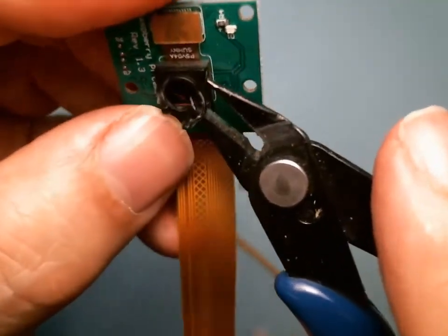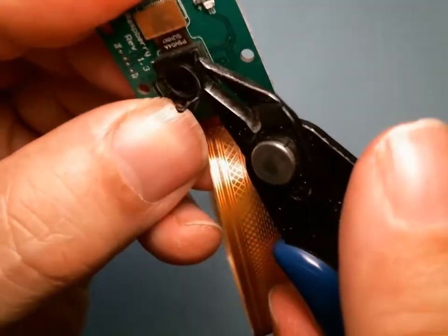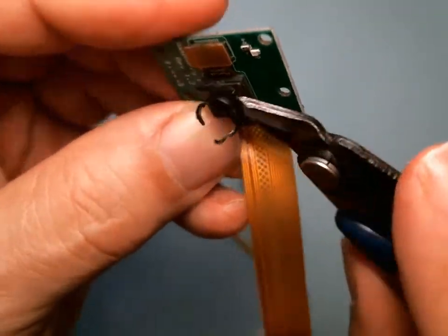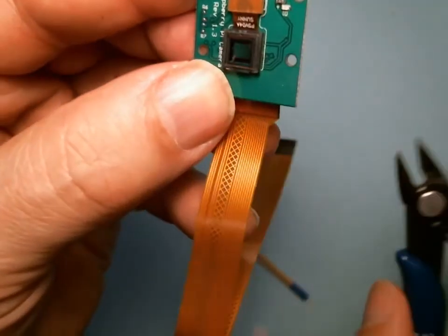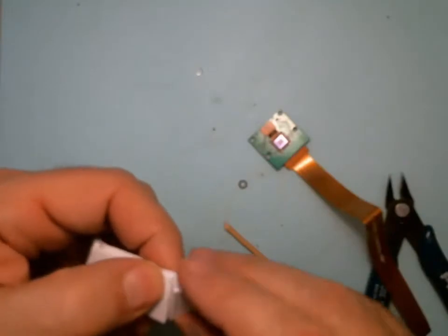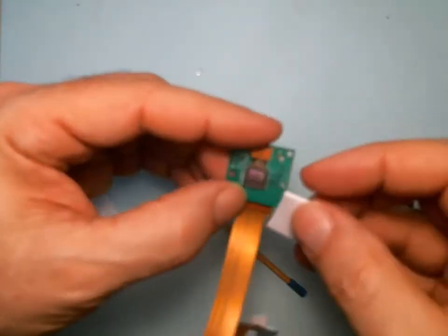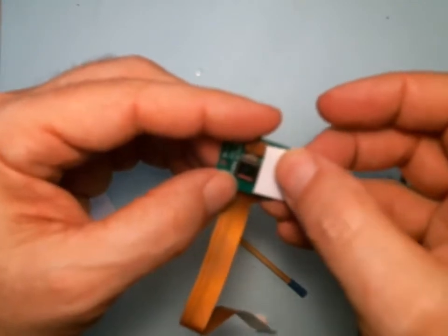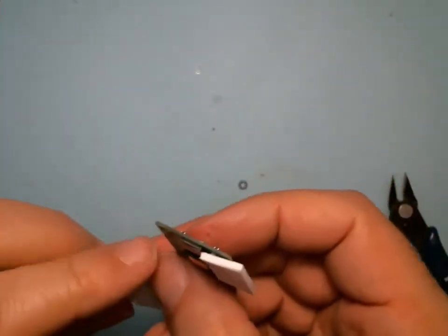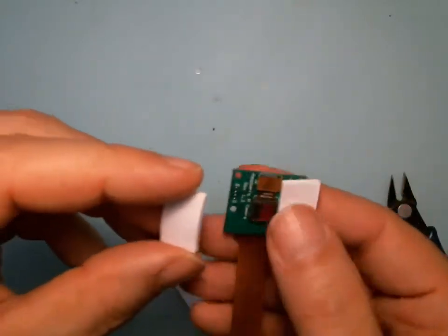Second corner — and once you get the second corner it really just wants to come off. It's popped off. You want to take two of these sticky foam pieces — one on this side, squeeze down, the second one on the other side.